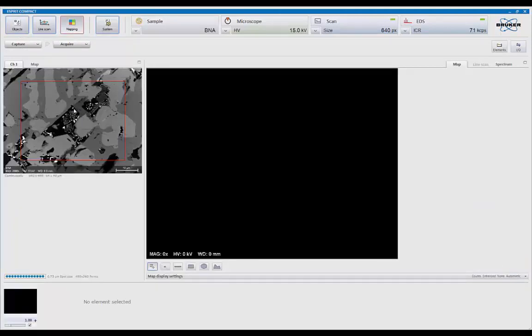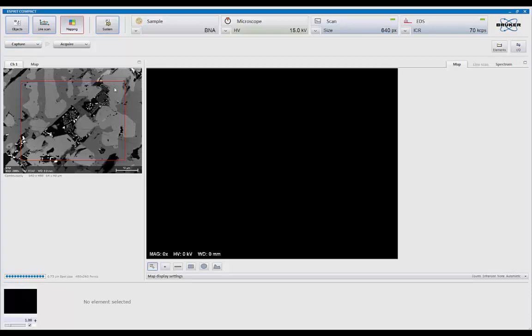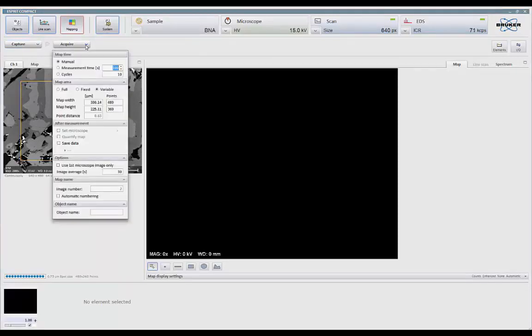Now, in this, again, I can capture the area of interest. Collection is exactly the same as it was in object mode. The acquire mode for the map itself, I've got a couple of choices here. Again, I can keep it set to manual, which means keep collecting until I tell it to stop.